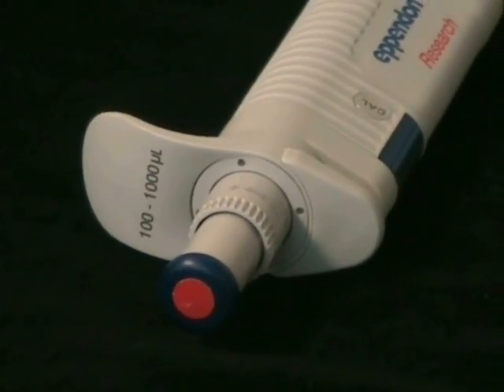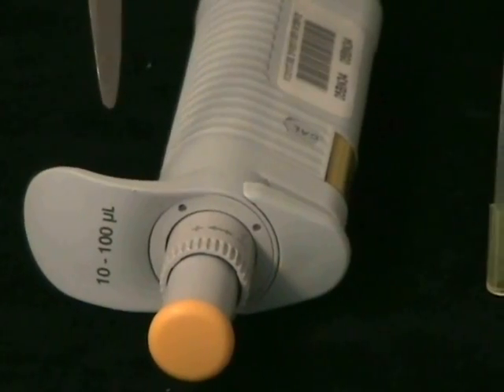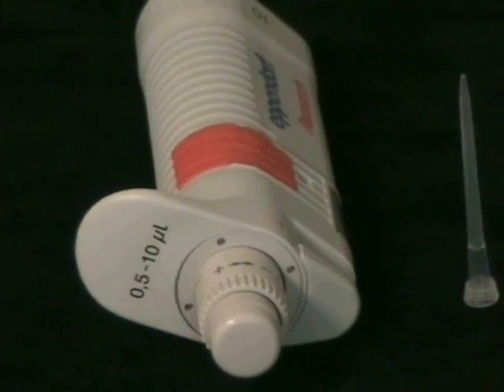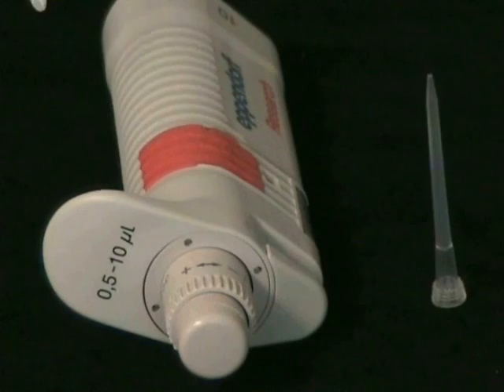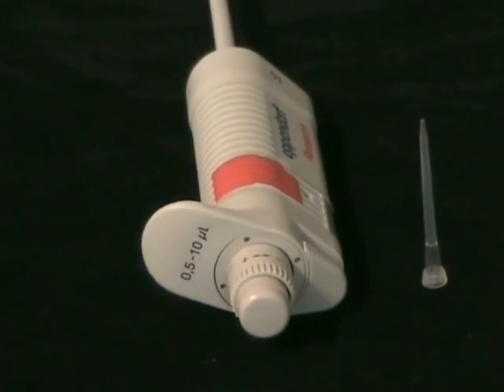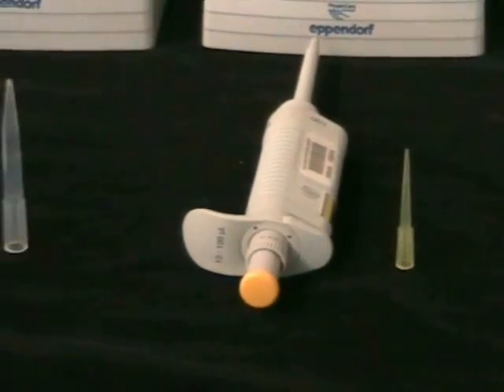At the midpoint we have the P100, which will do from 10 to 100 microliters, and at the end we have the P10, which will do from 0.5 to 10 microliters. Beside each pipette we've displayed the tips that we use. It's imperative to use the right tip, otherwise you get the wrong volume.